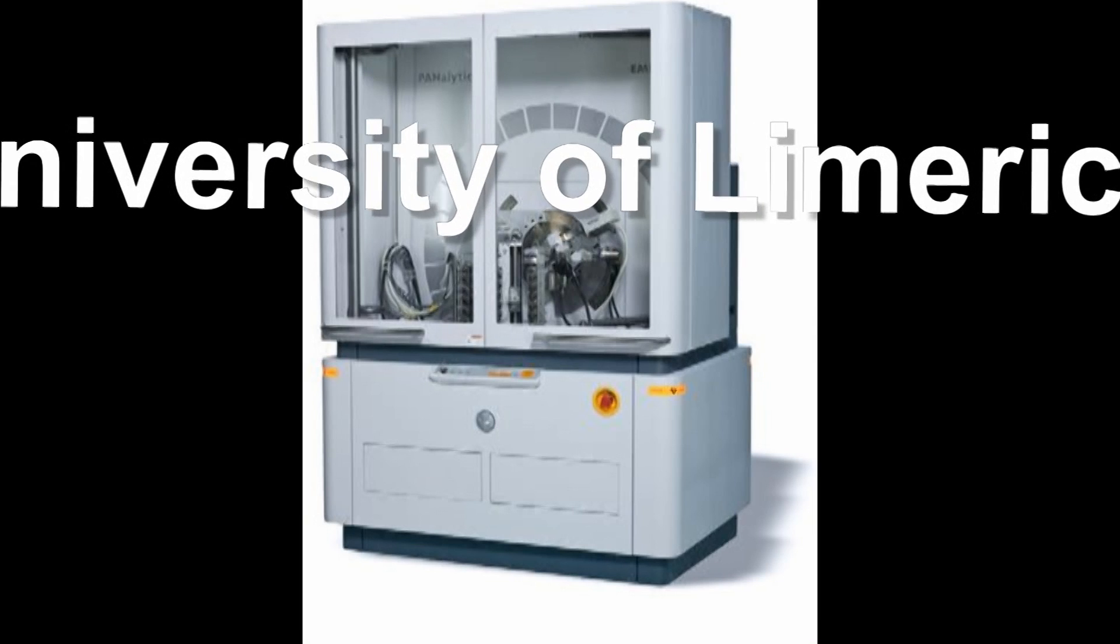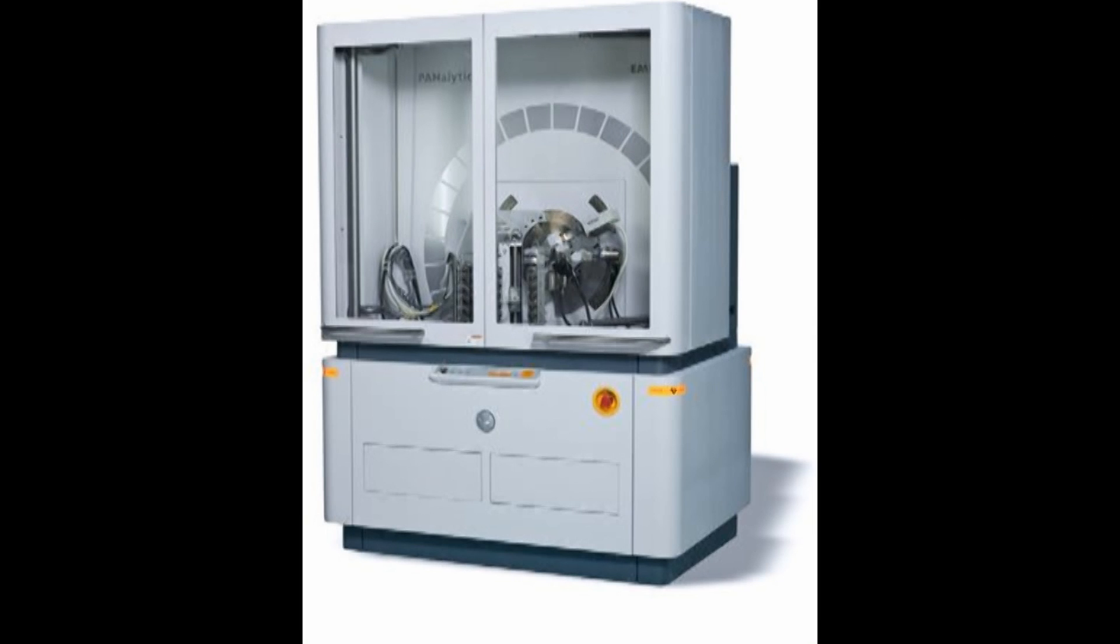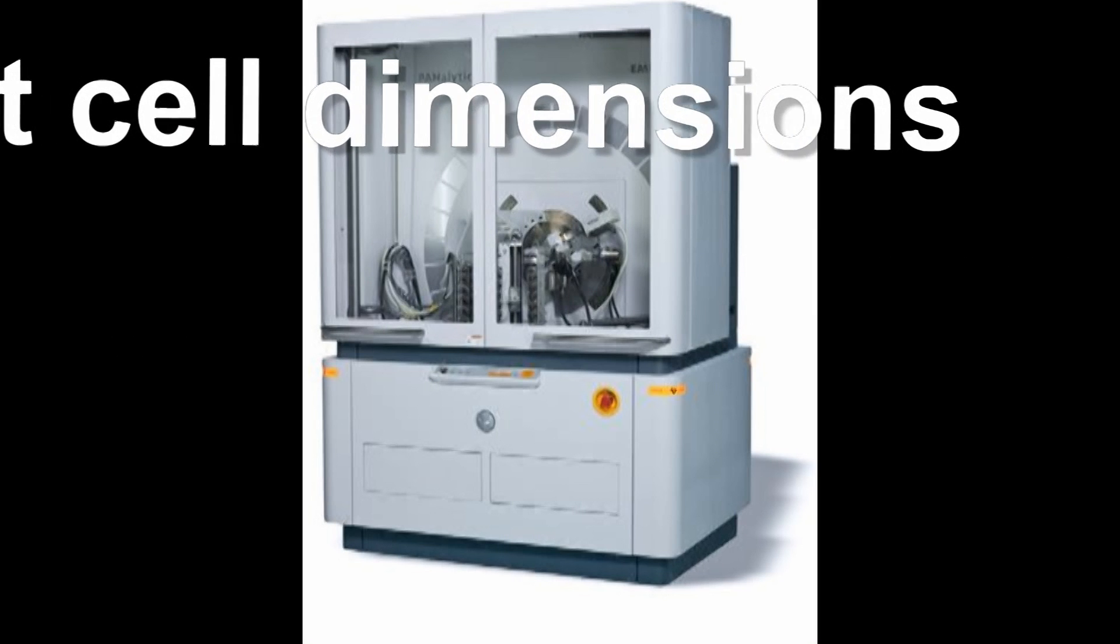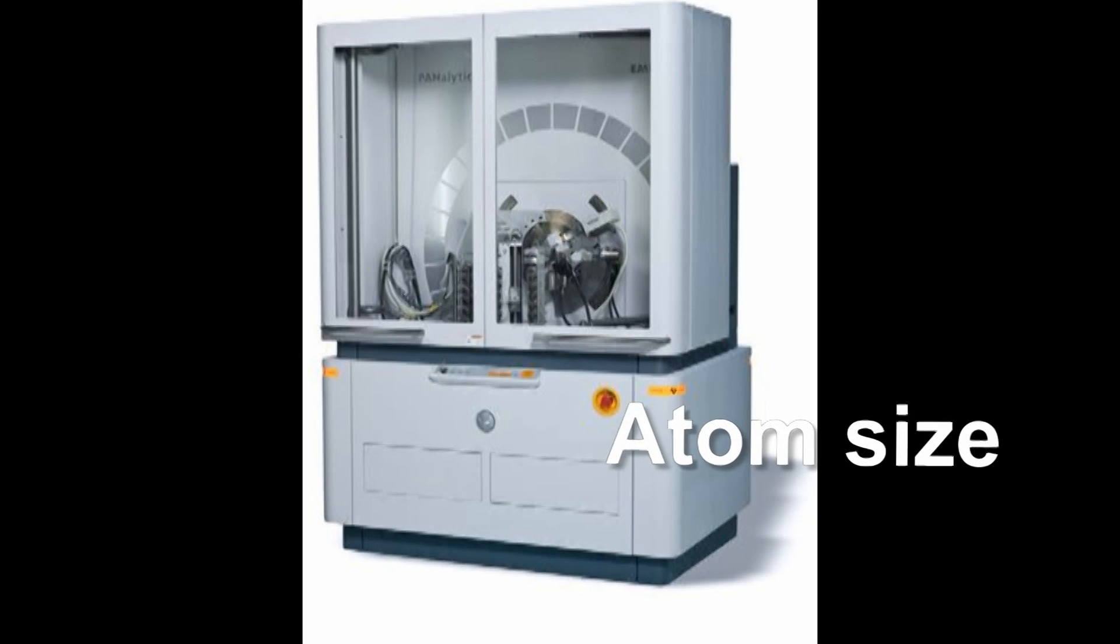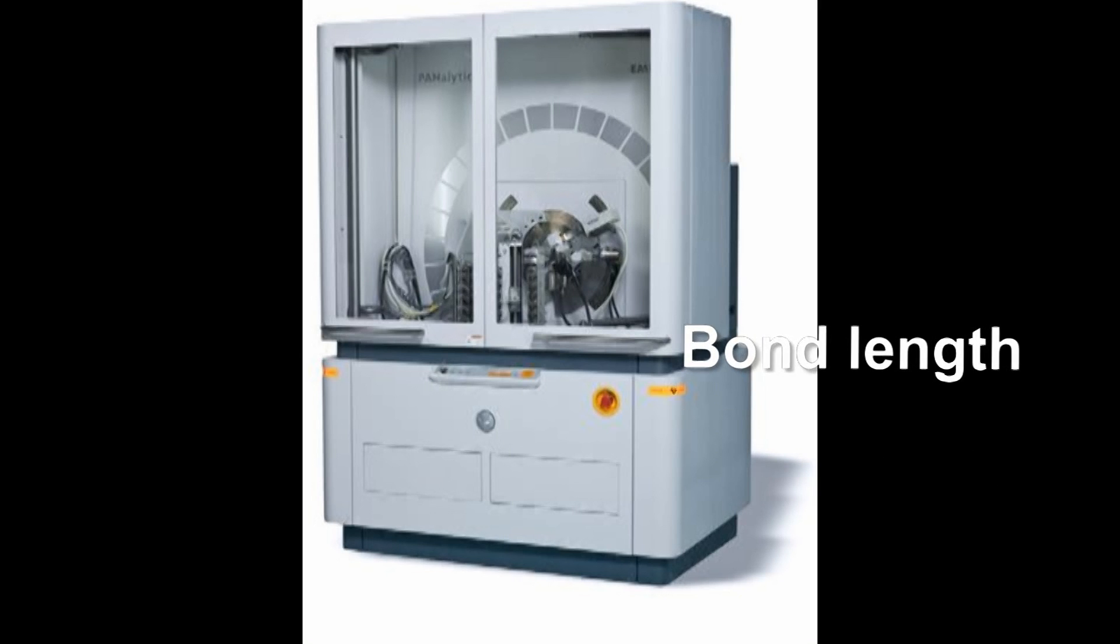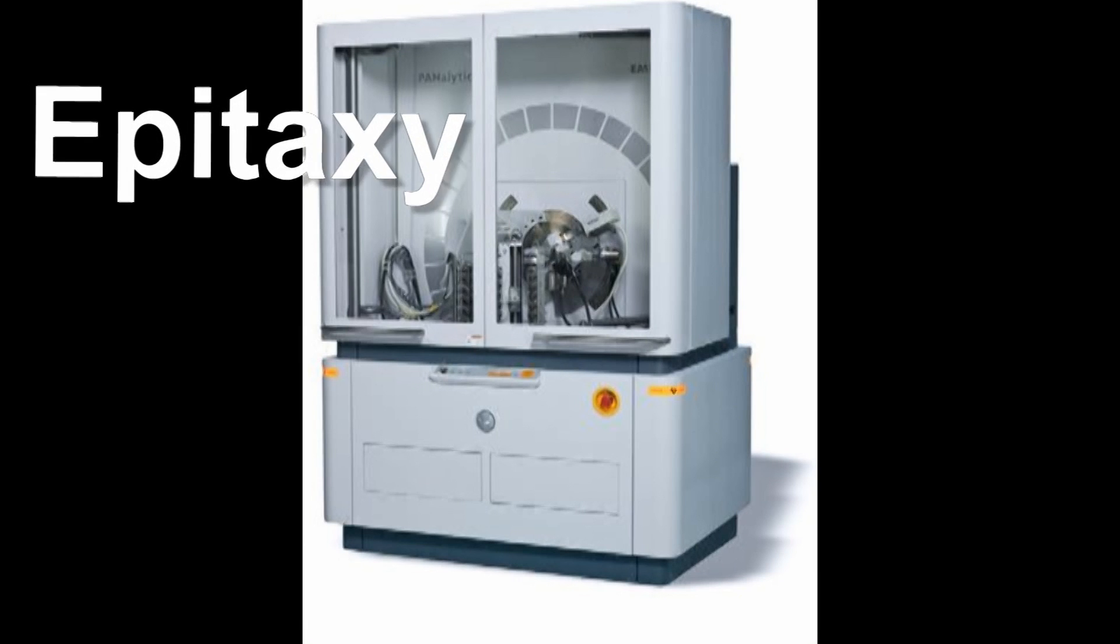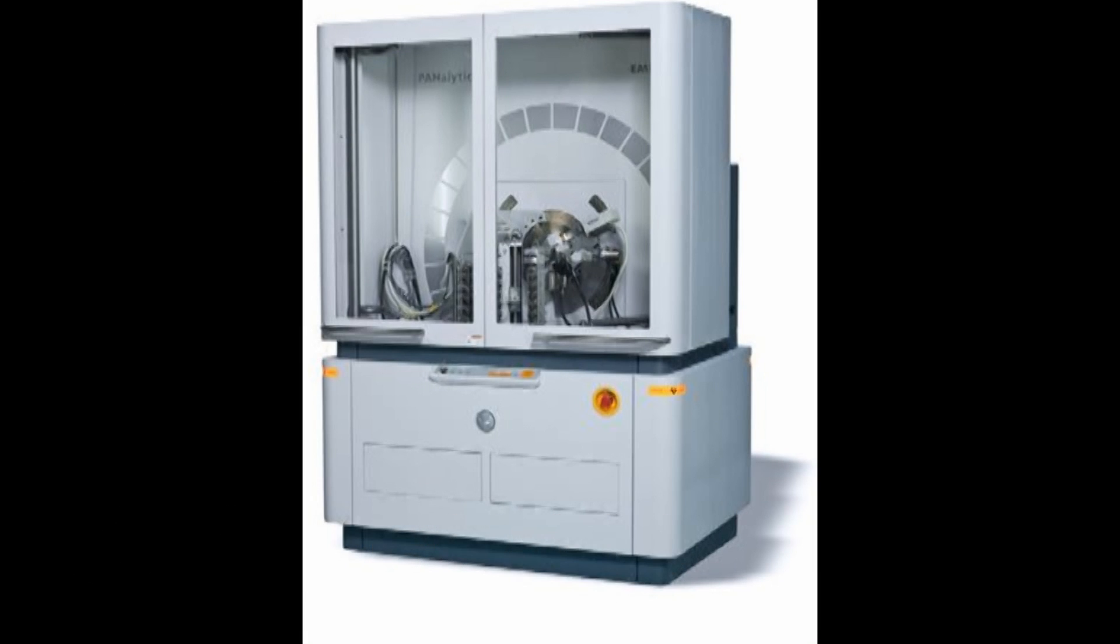X-ray diffraction is an analytical characterization technique employed to identify crystalline phases that may be present in the material. It also provides information on structural properties such as defect structures, epitaxy, grain size, and different phases.